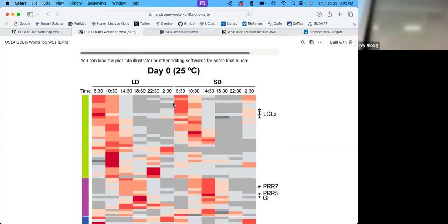Oh, I see. Yeah, so the color is somehow random. You have to figure it out. But then also this, like the gray, red, I don't seem to have the same patterns. Well, it's the same data. Yeah. So this is that. It matches. So it's flipped? No, it's the shift, it's that chunk.